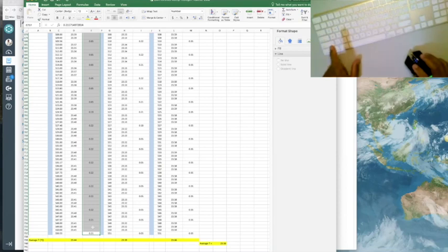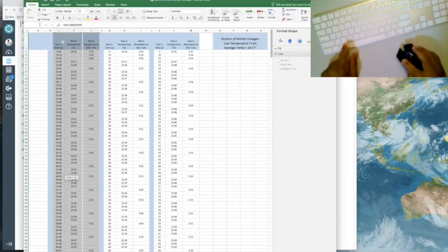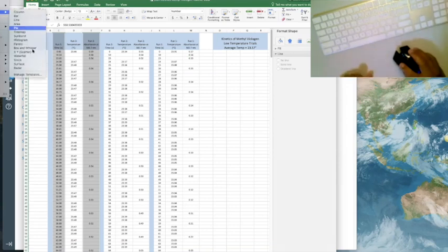Press the command button down. So, okay, and then I'm just going to go all the way up. Then I'm going to move my mouse over here, so the absorbance and the time are highlighted. Release, and then I'm going to do an insert chart, scattered.